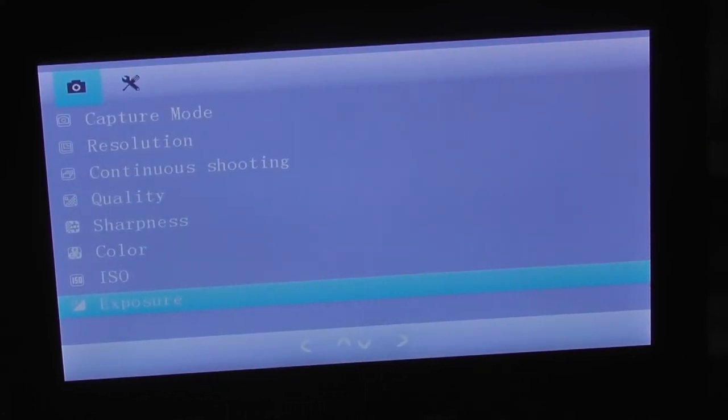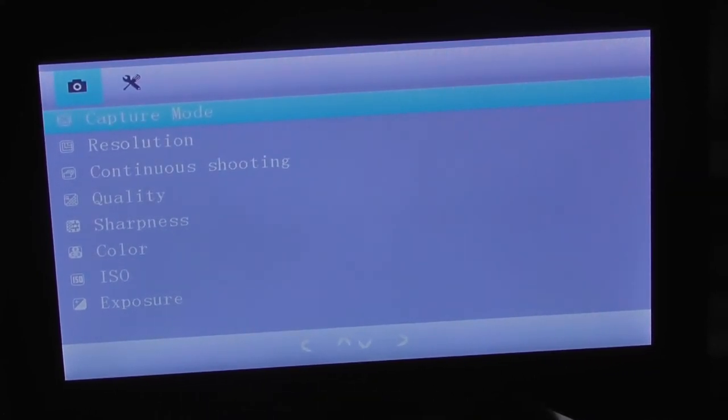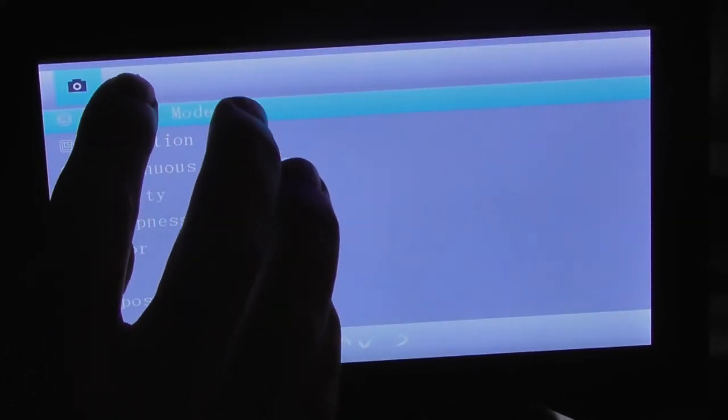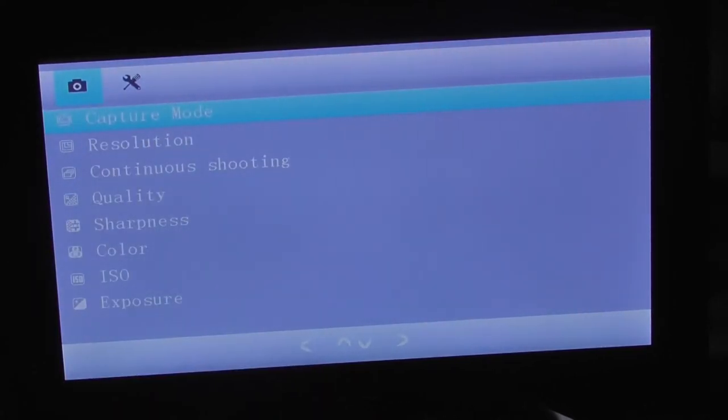No, it's not touch screen. Because you have 2 points over there and 2 points up and down. So how do you go left and right? I keep thinking this is a turn off, but it's to lock the microscope. The telescope. No, microscope, man. How do I go over here? That's photo, but how do you get there? Oh, you double press.